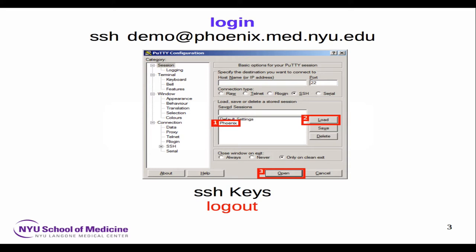Then, afterwards, you are on the machine, you start working, you are doing your calculation, you perform whatever you need to perform. By the end of it, always log out. Logging out would do a very nice and finalized bookkeeping of what you have done and the processes that have been done. And so you want all of them to be finalized and recorded properly, because if there is a problem, you can actually figure it out afterwards.